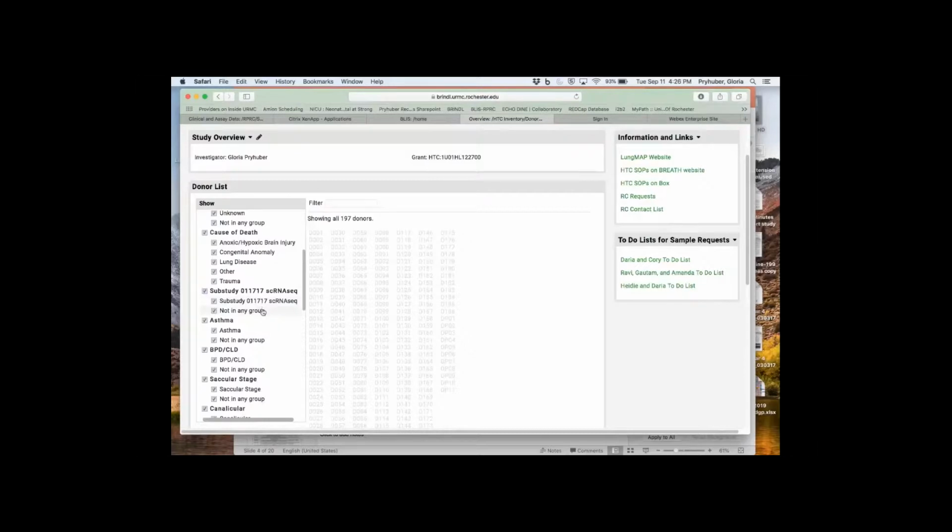The other thing you can do, each one of these groups, if you click on it, that'll give you just the list. So it stays there. You can copy it, whatever you want to do. When I then go on that donor, it shows me what other samples you have of that? Yes. I'll show you that in just a second, just to make sure everybody's oriented.